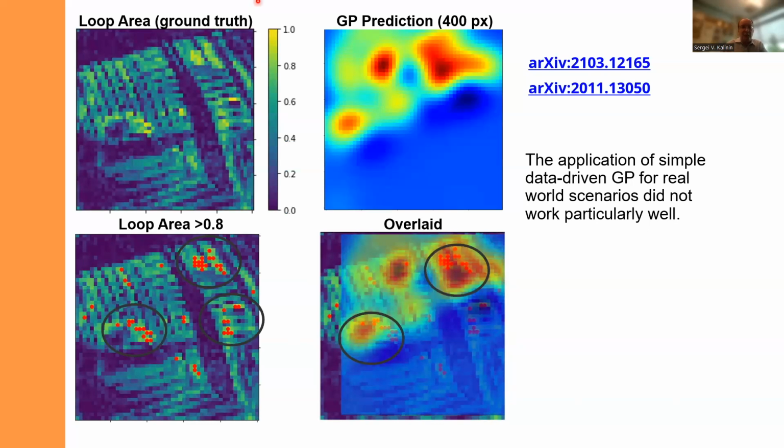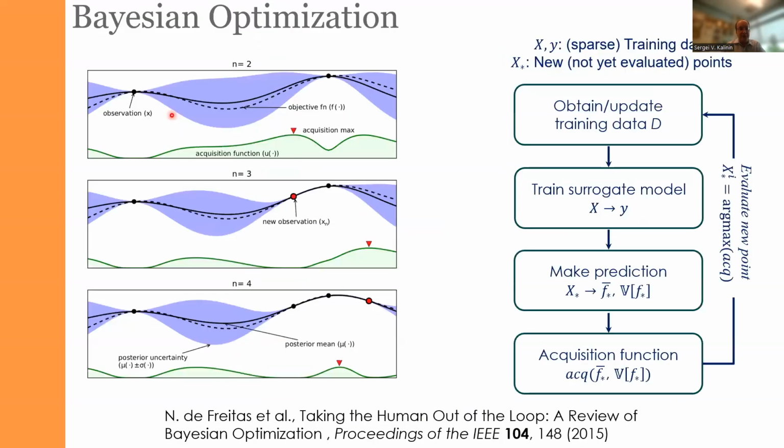This is exactly the reason why we are going through the details of the Gaussian processes and the kernel function, because by now you're already familiar with the fact that the kernel function represents the spatial correlations in the system. So the problem is that if our image has very sharp edges and a lot of small features, the kernel cannot represent them very well, which basically means that we need very dense measurements. And in this case, the Gaussian process doesn't offer any particular advantage compared to grid measurements. In fact, grid measurements are better because the scanning process in the instrument is also simpler.